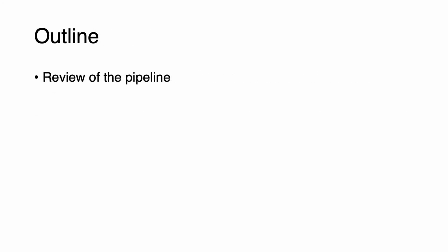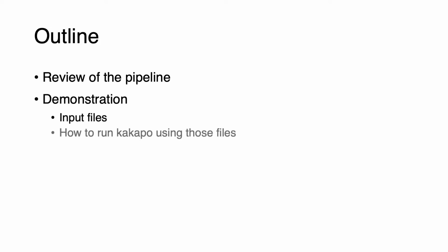In the rest of my talk, I will first review the key steps of the pipeline. Then I will show you a demonstration of Kakapo. I will do a brief review of the input files. I will then show you how to run Kakapo using those files. And finally, we will take a look at the generated output.